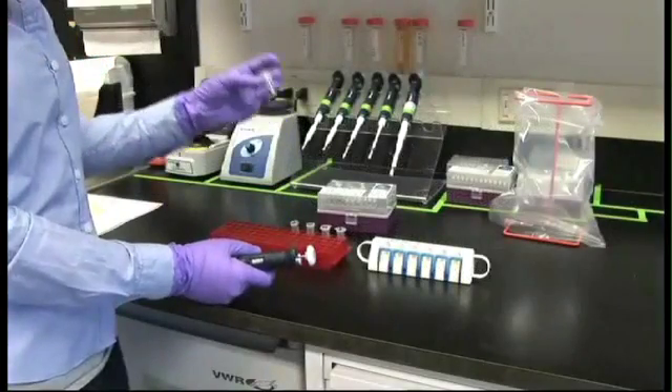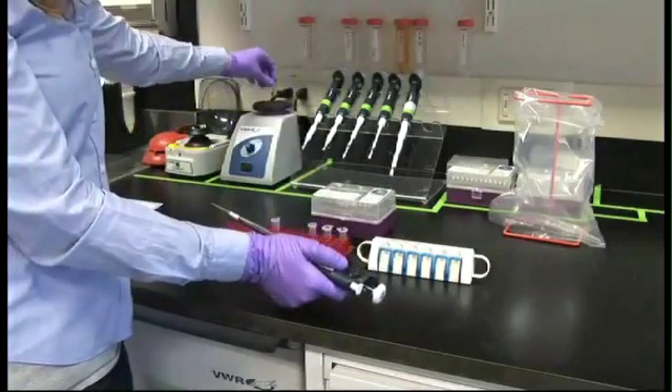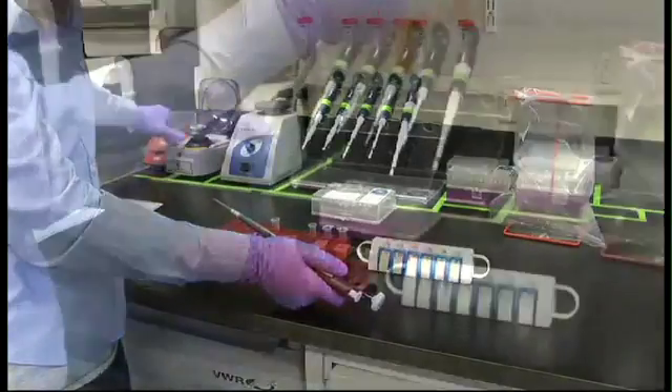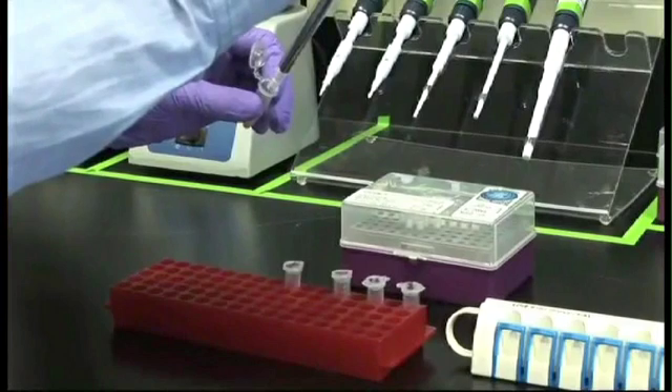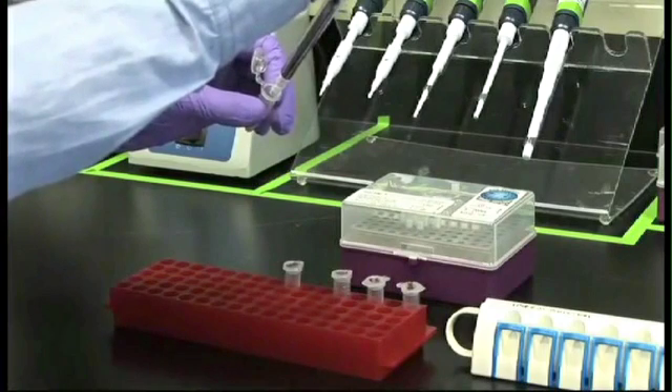Begin with a sample in a 1.5 mL tube and a bottle of SPRIselect that has been well mixed by vigorous shaking or vortexing. Add a volume of SPRI beads equal to 1.8x the volume of the sample to your sample tube. Pipette mix or vortex to achieve a uniform mixture.